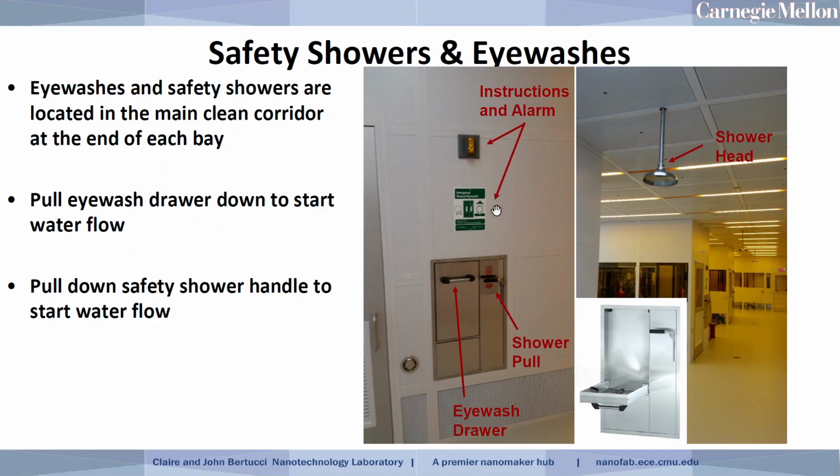If those are activated, there will be an alarm here that goes off to notify other users in the area that someone's having a problem here, and then there are instructions here as well. But it's pretty straightforward.